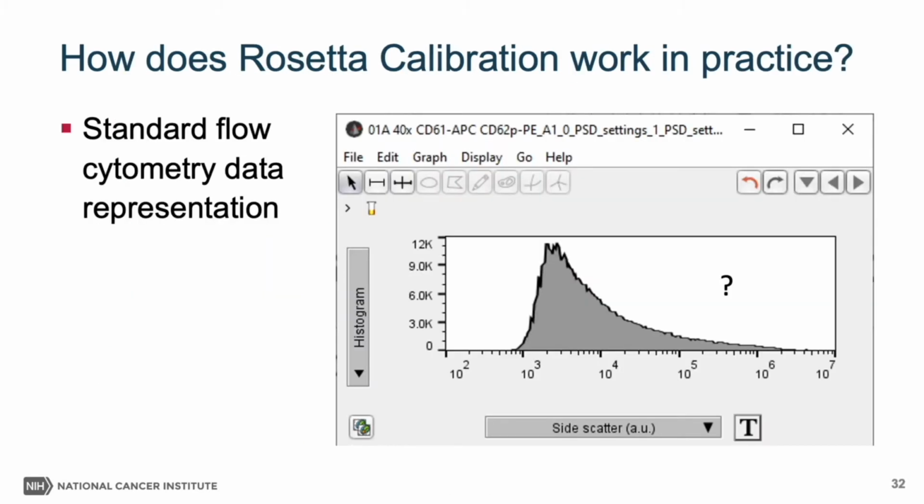So how does this work in practice? Do you have to be bothered with MIFlowCyt-EV? In practice, I suppose you measure light scattering and analyze the signals with your favorite flow cytometry data analysis software. As an example, I showed here the side scatter histogram of particles from human urine. Because the data are in arbitrary units, this plot provides limited insight.